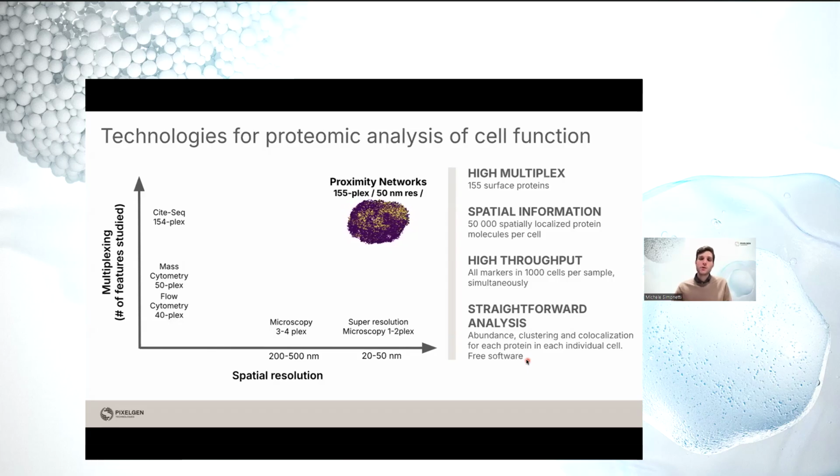Now, how are we able to have this very high resolution with this very high multiplexing without having the drawback of microscopy, for example?